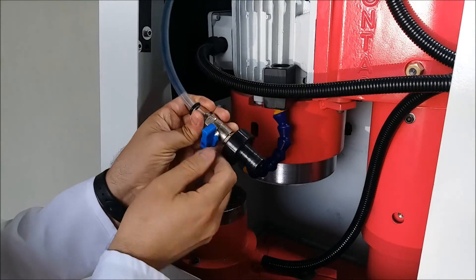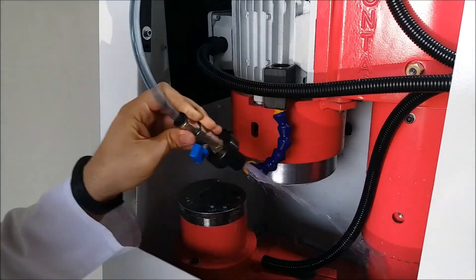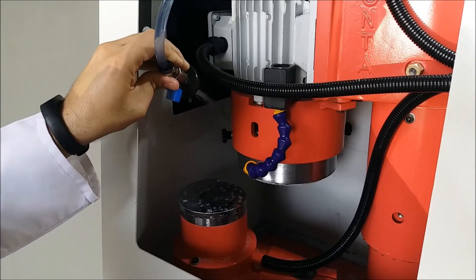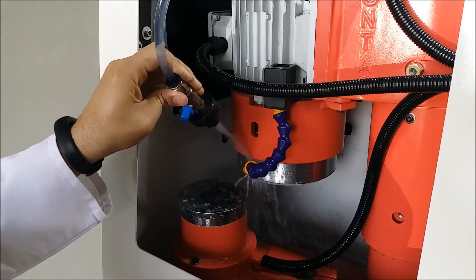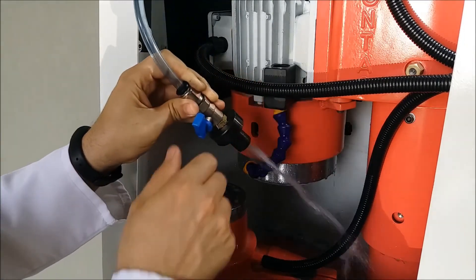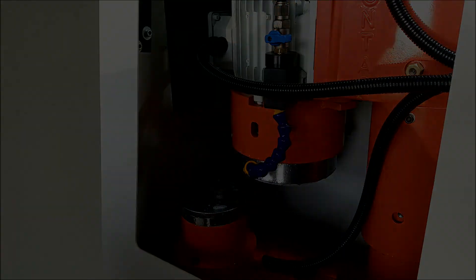With the moving water nozzle, cleaning the machine is really simple.